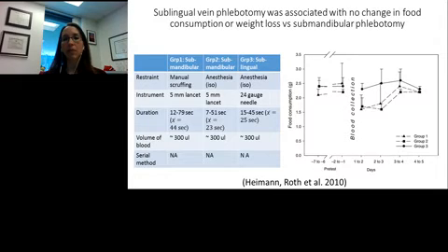So they looked at either Group 1, where mice had the submandibular vein punctured, and those mice were just manually restrained. Group 2 were mice that had the submandibular vein punctured, but they were fully anesthetized. And then Group 3 were mice that were anesthetized for sublingual collection.